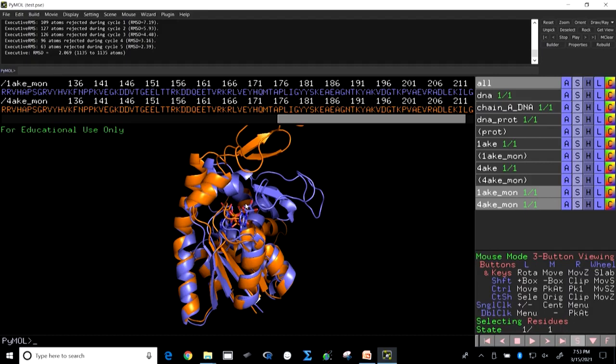Kinases, if you go and check in the literature, are enzymes which go through a huge conformational change. They have a big loop called the P loop, and this P loop changes its conformation, open to close, close to open, and this is how a protein declares its state of work. It has to do some reaction or not.